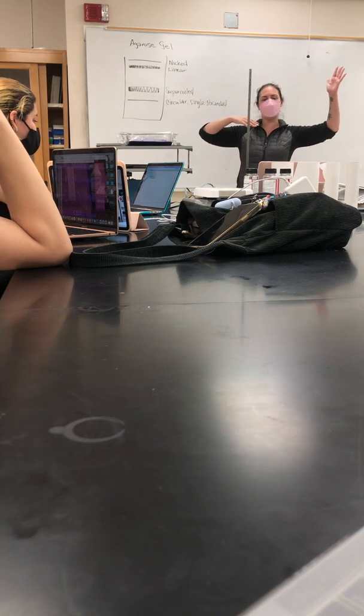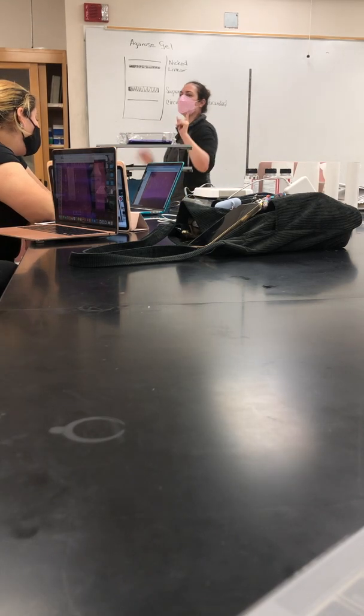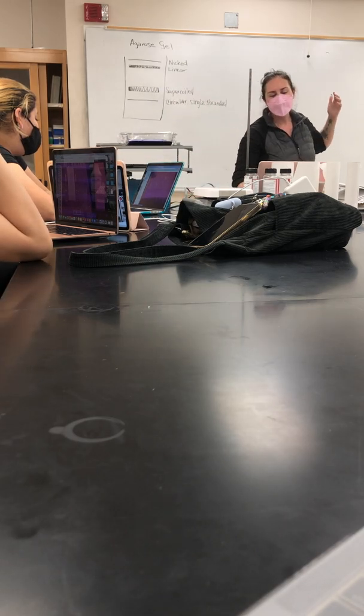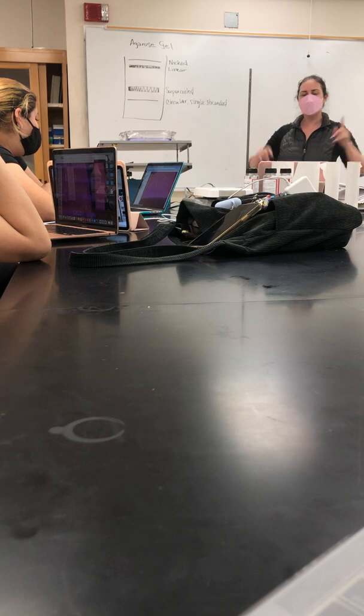But where you're looking is, okay, second lane, you see that really dark marker for the molecular weight. Right above it, on the left, is that positive control. So I put the positive control on the left, and we can actually see those 3 bands if you kind of zoom it up. So right here, 1, 2, 3. Right here, 1, 2, 3. Right here, 1, 2, 3.